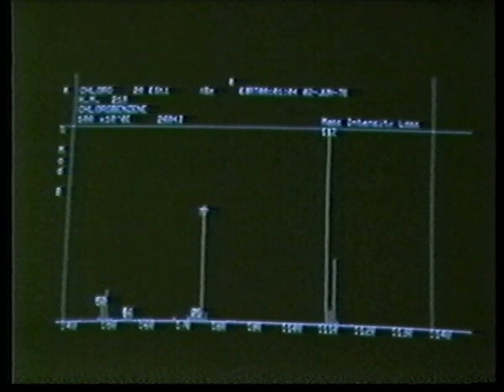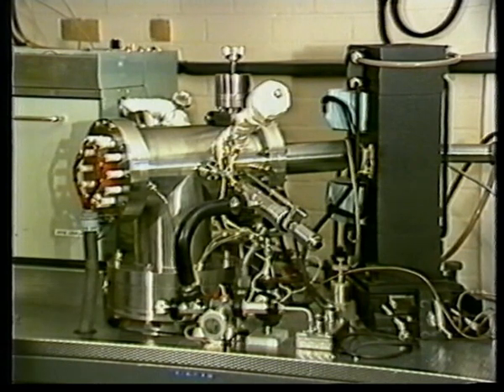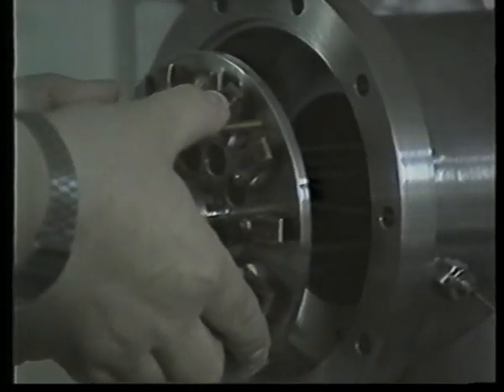Let's now look at the mass spectrometer in more detail. Here on the left is where the sample is ionized. Now this is known as the source. And it's shown here being removed from its housing.